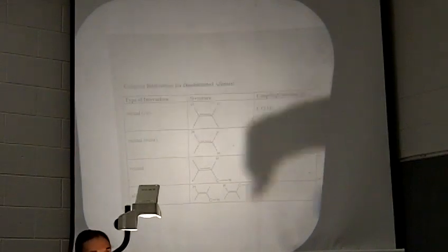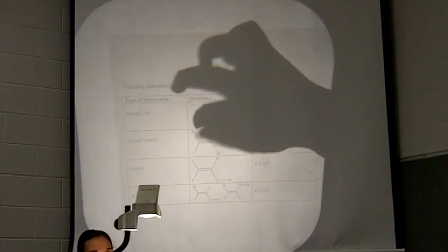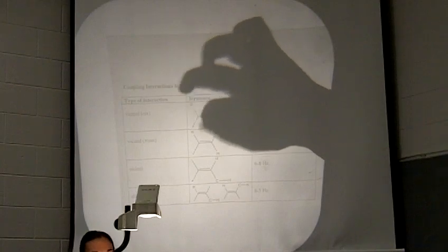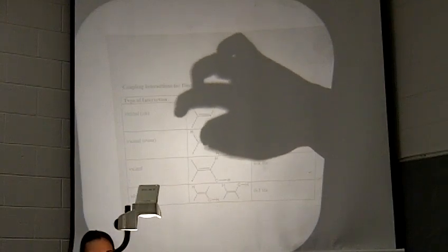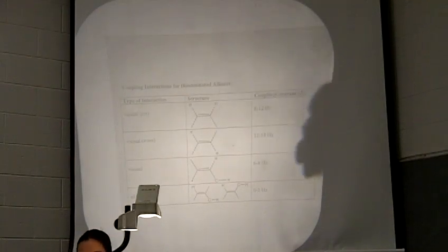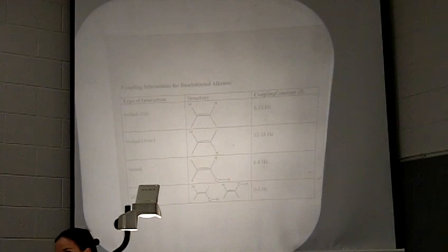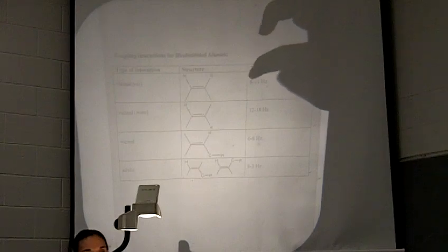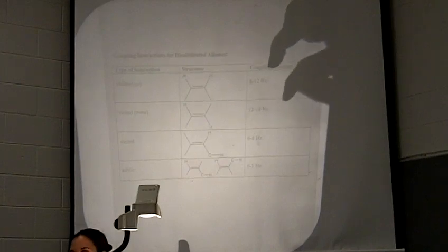The vicinal cis and the vicinal trans are closer than just the vicinal, okay? For vicinal cis and vicinal trans, you're just two neighboring carbons, right directly across that double bond. It's just proton, carbon, carbon, proton, that relationship. Cis are the protons cis to each other across the double bond; trans are trans from each other across the double bond. Either they're on the same side or opposite sides. For cis, the coupling is about 8 to 12 hertz. For trans, the coupling is 12 to 18 hertz.